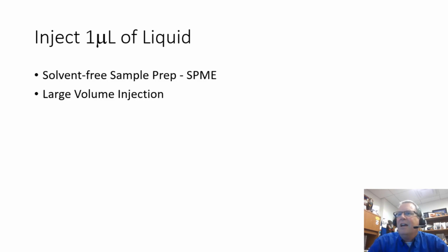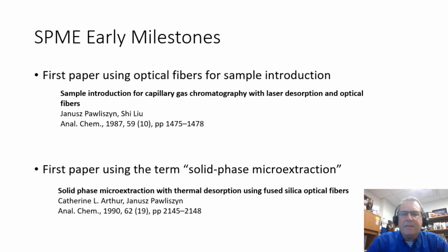And also one thing that's been a little bit overlooked in gas chromatography is just injecting larger volumes. And inlets today for GCs that come on a lot of the larger laboratory systems can inject larger volumes. One thing you might want to think about, you can buy a little bit more sensitivity, as long as you're conscious of how much solvent you're injecting. Just try injecting a little more. If you're doing 1 microliter, try 2. See what happens.